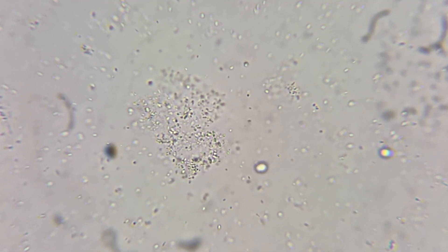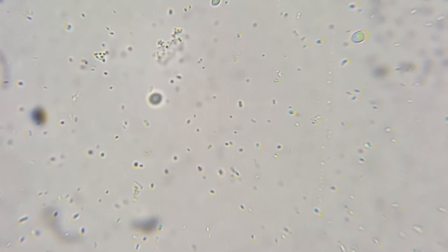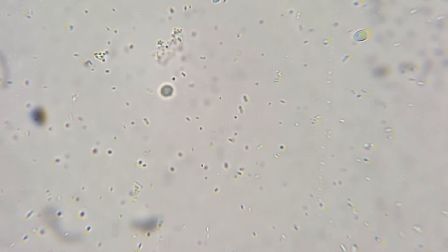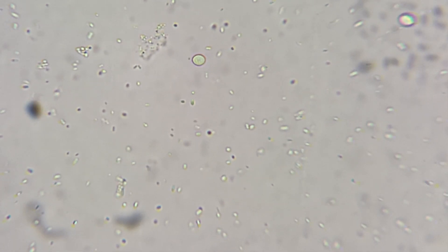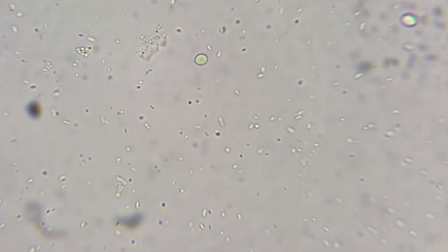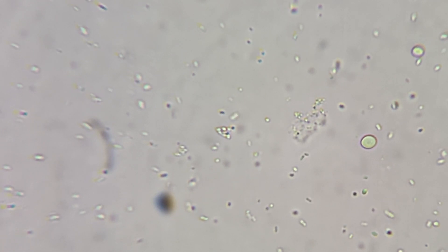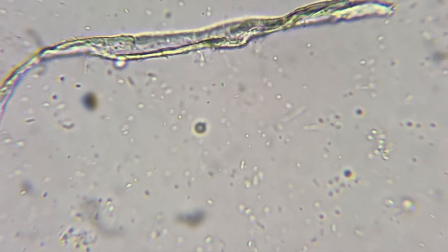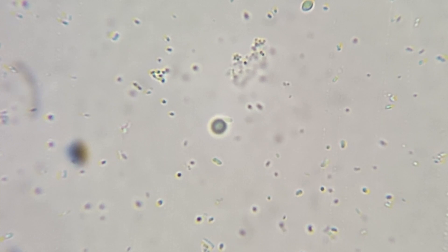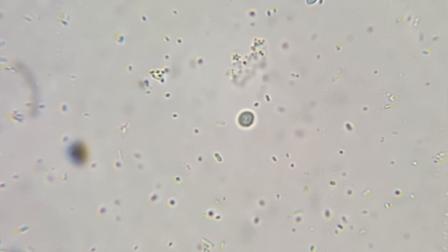I don't see any long chains of spherical bacteria, so no streptococci. A lot of them are singles, with some pairs and clusters. As for the rod-shaped bacteria, there are some singles, a lot of pairs, and just a few very long chains. As I was moving around the slide, I did catch a few motile bacteria — which is really exciting — meaning these bacteria are swimming around the slide using flagella. This could be Lactobacillus helveticus, Lactobacillus fermentum, or possibly Bacillus subtilis, all of which have flagella that help propel them.